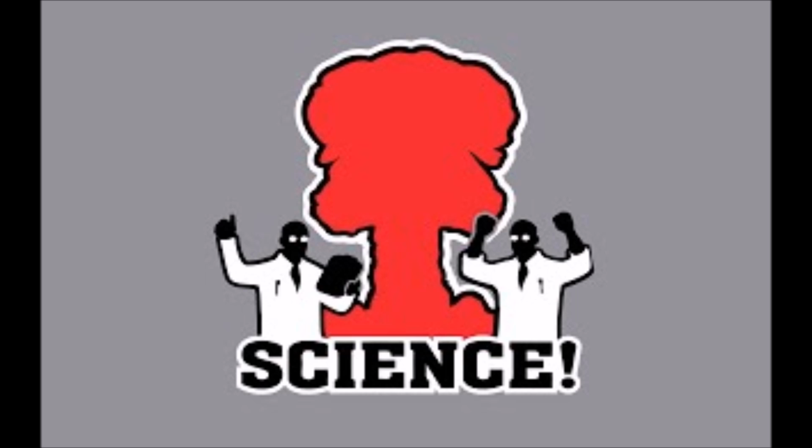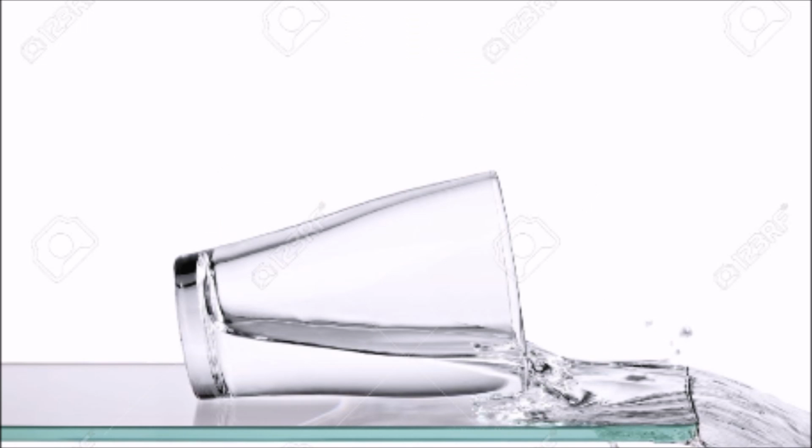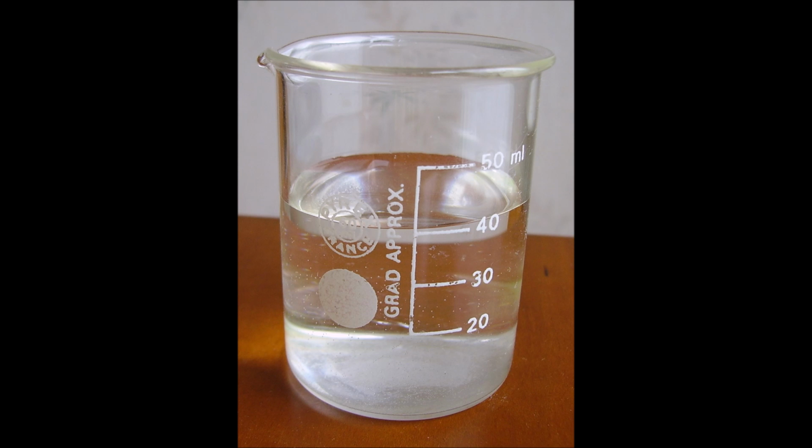Okay, so that was a lot of chemistry, and now we're going to talk about our individual crystal vials. Unfortunately, we have no crystals. This could be due to several factors. A, time. There just hasn't been enough time to allow enough water to evaporate. B, we might have knocked it over. Oops. C, we're just cursed. In any case, the solution is still clear and colorless with no crystals forming.